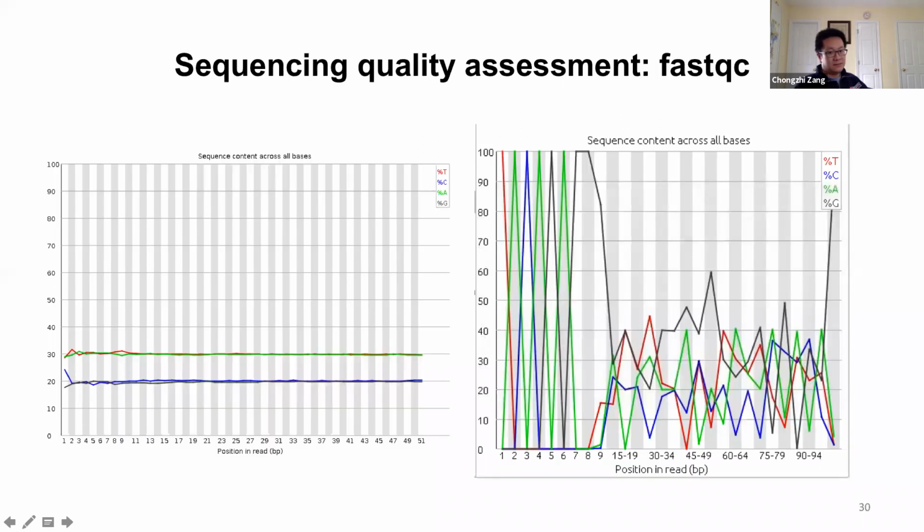Yeah, so, yes, question? I have a question. As I understand it, in normal conditions Illumina doesn't sequence the adapters, because in the left picture we don't see the first 6 base pairs. Right. So it means that during sequencing, Illumina doesn't read the adapters. Right, which is supposed to be the case. So the sequencing machine is not supposed to sequence the adapters.